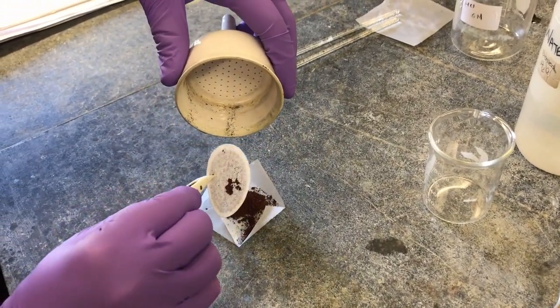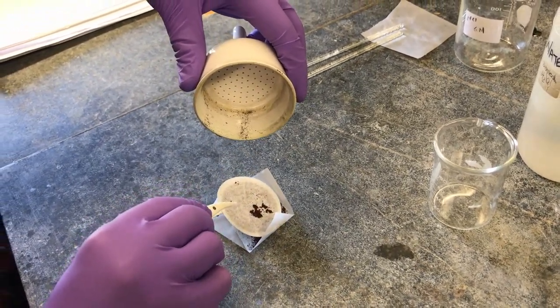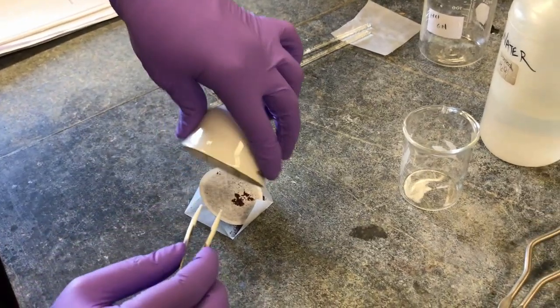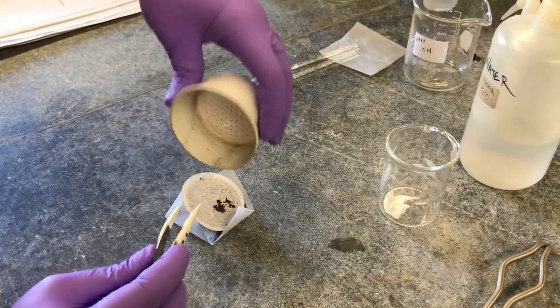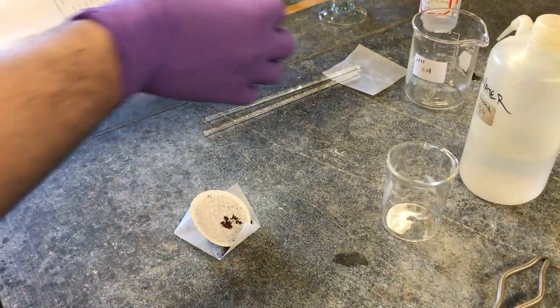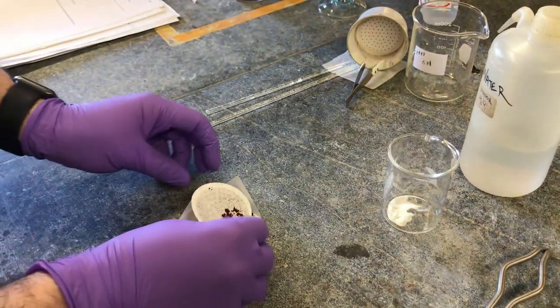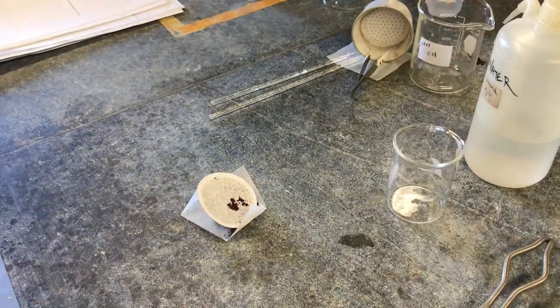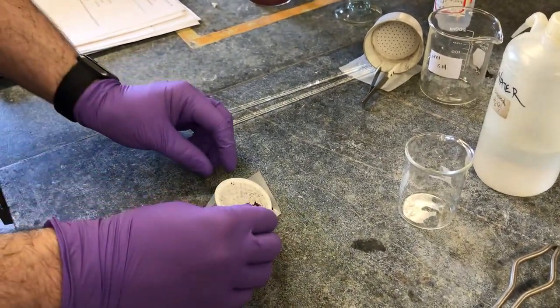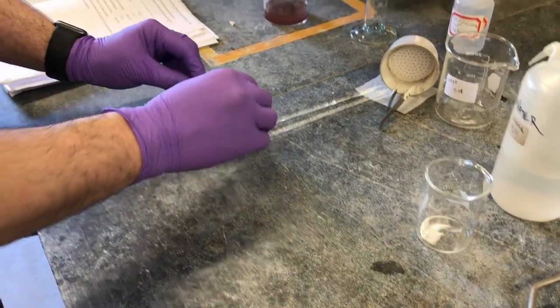We're going to also be weighing the weigh paper too, because there's a lot of copper that's actually in the weighing paper itself. So just dumping everything. That's okay. Everything's pretty much on there. So we're going to carefully bring this over.